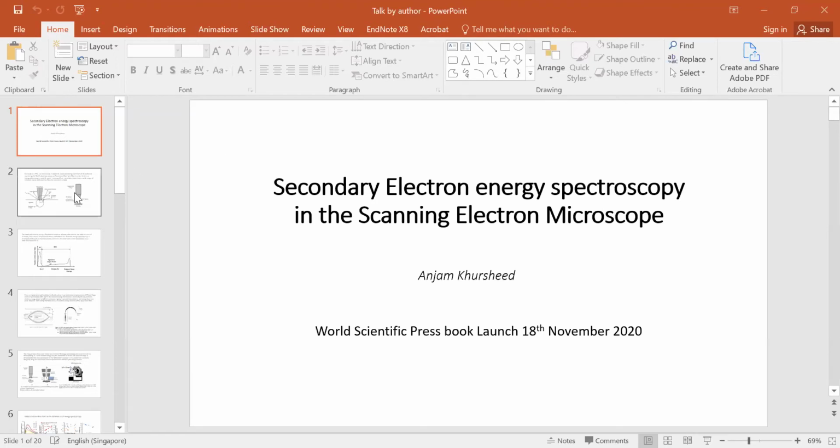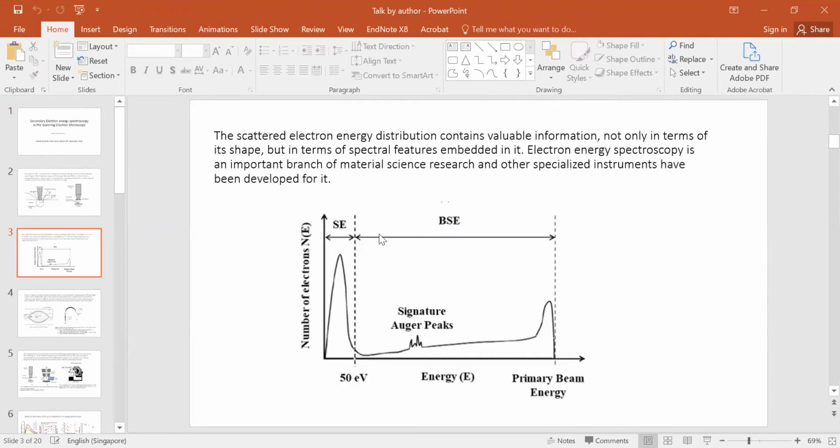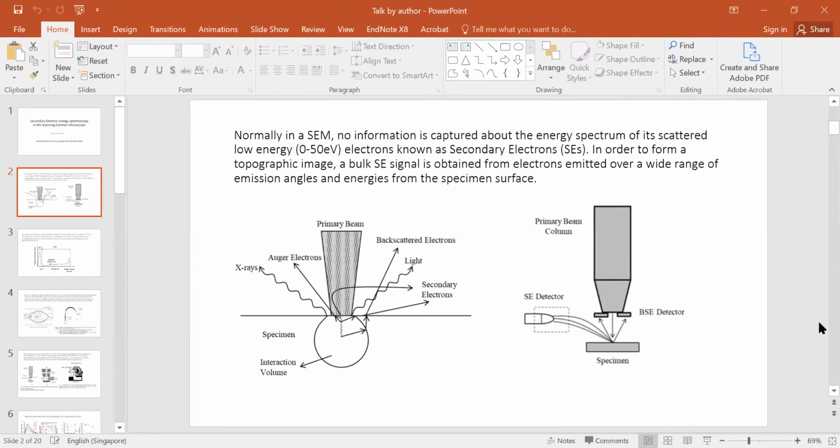First thing to say is that I'm sure you all know that secondary electrons are the low energy electrons that are scattered back from a specimen when the primary electron beam strikes the specimen. There are a range of different scattered energies emitted from it, and the secondary electrons are usually the low eV electrons that are defined to be below 50 eV, but most of what you collect are a few eV up to 10, 15 eV, but not too much beyond that. They are very low energy scattered electrons, the main electrons used for topographic imaging in a scanning electron microscope.